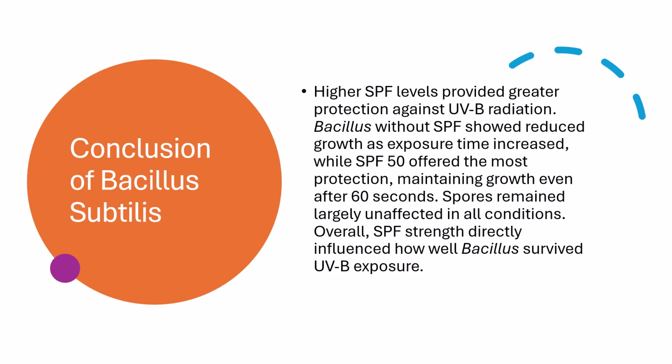We saw Bacillus without SPF showed very reduced growth as exposure time increased, while SPF 50 offered the most protection, maintaining growth even after 60 seconds. Spores remained largely unaffected in all conditions. But overall, SPF strength directly influences how well Bacillus survived under the UV lights.